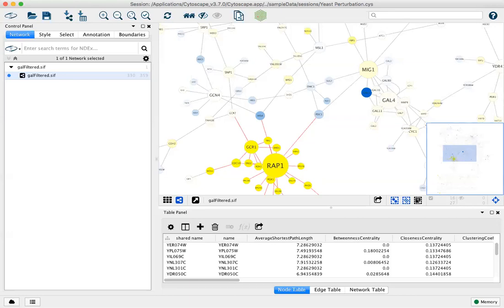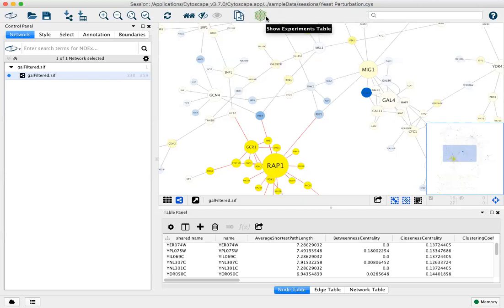This is Cytoscape 3.7.0, and now you have the ability to customize your toolbar. Along the top of Cytoscape are a number of icons provided by default, and apps can provide and add icons as well.